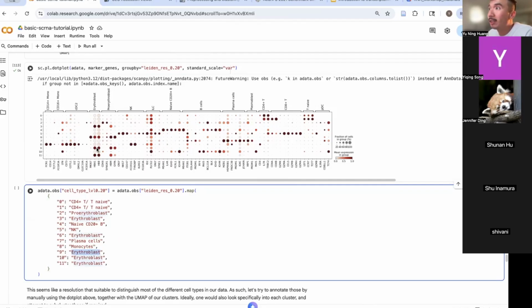And then the nine, I think I would go for the same one as three because they have a similar transcriptomic profile, like three and nine. I also do it for 11: 3, 9, 11. Okay, so now I just need to look at my 10. My 10 looks like a B cell. So I would just do the 10 is B cell.